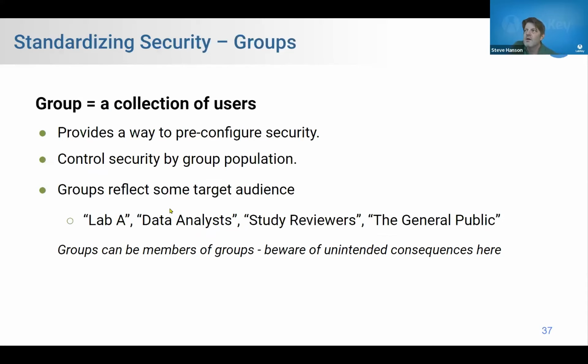Groups are a way to pre-configure and standardize security. Basically, security is about giving power to the right people over the right folders. You're saying this user can see this folder, and this other user can be an editor in that folder.